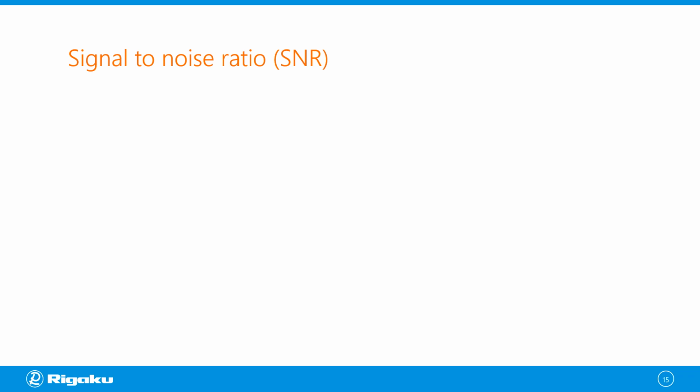Okay. The next parameter is the signal to noise ratio. The rule here is kind of subjective, but shouldn't be too difficult one to judge. So this needs to be high enough to segment the image clean.